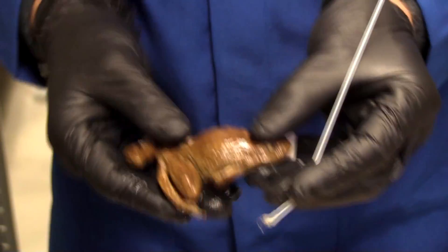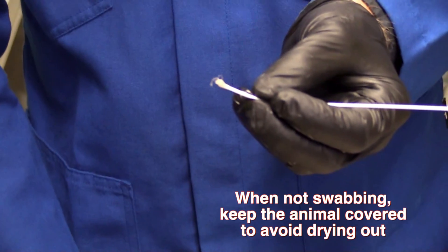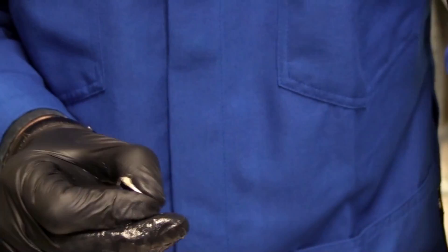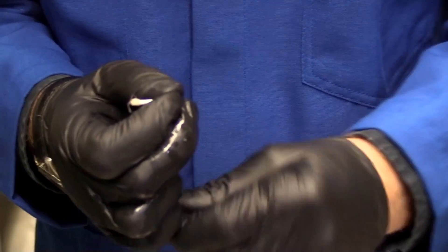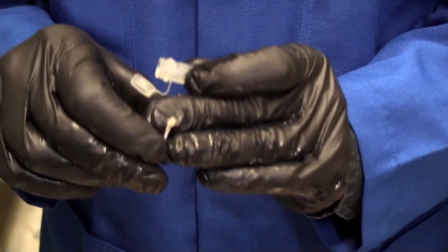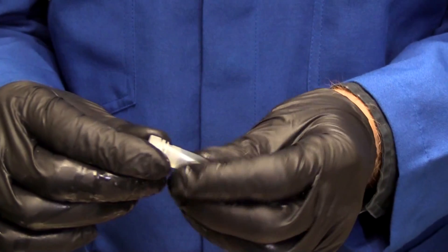These specimens are priceless, so I'm going to be very careful and put it down, and cover it up so it doesn't dry out. We're looking to see whether any of these animals that were collected years ago may have been infected with a fungal pathogen. We can now extract the DNA from the swab and see if our pathogen is actually on this animal.